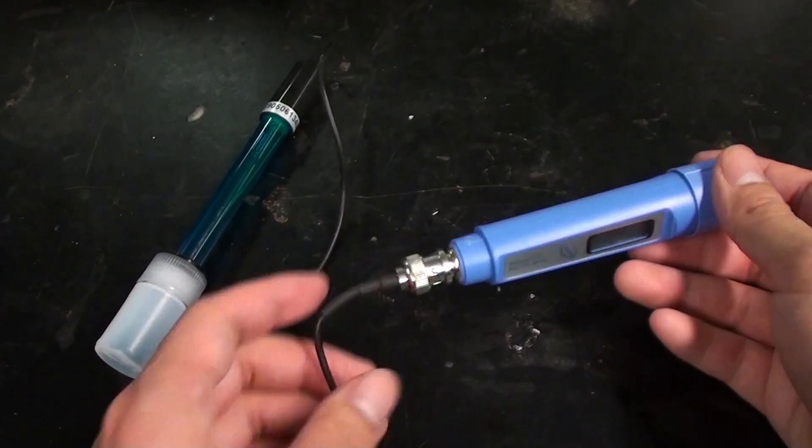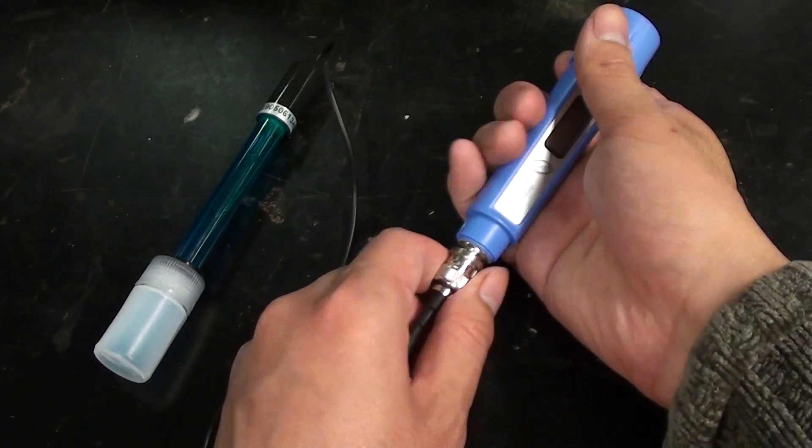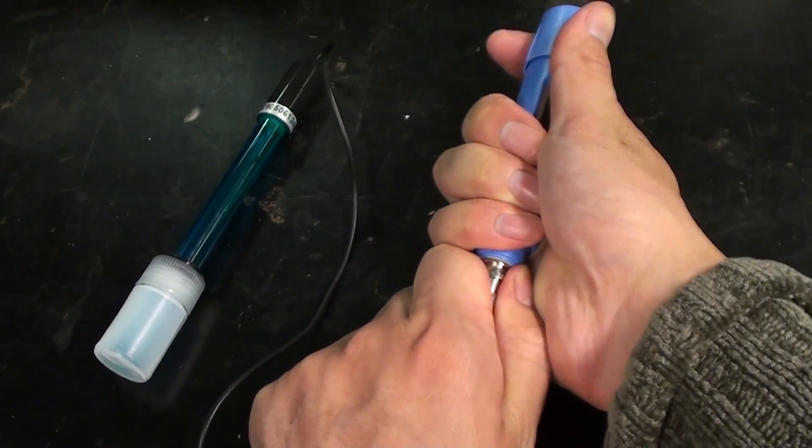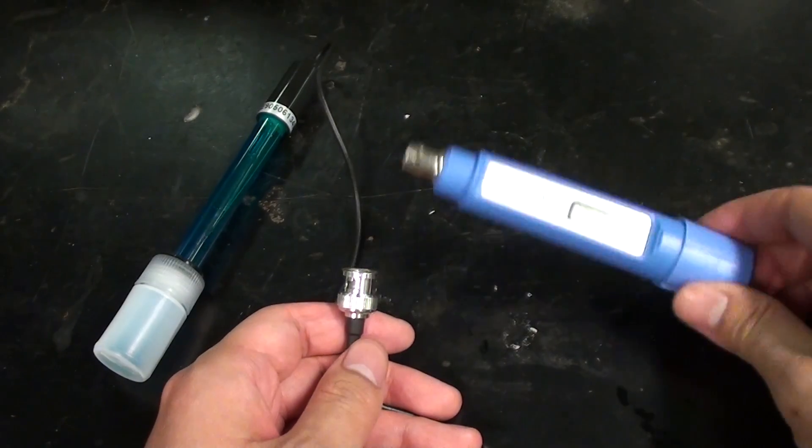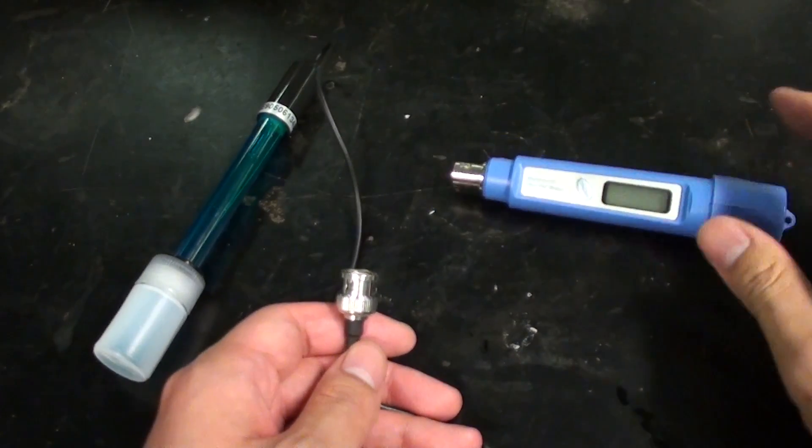But eventually you'll have to replace it. All pH electrodes are connected by a standardized BNC connector. Just disconnect the electrode and keep the meter. You can then connect another electrode to it.